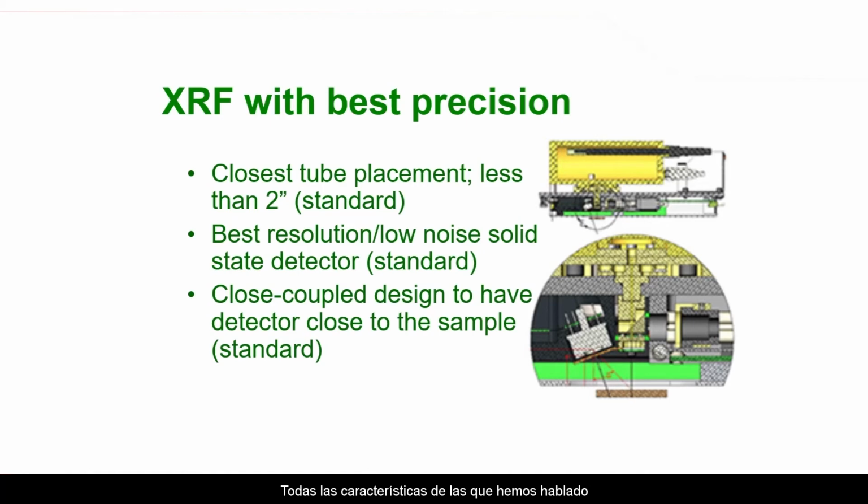All of the features that we discussed, emission and better resolution through close coupling, that is, the distance between the sample and the X-ray tube, provides the best configuration to achieve the best precision.